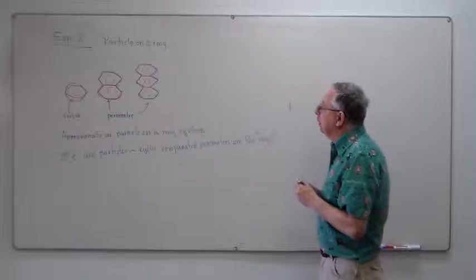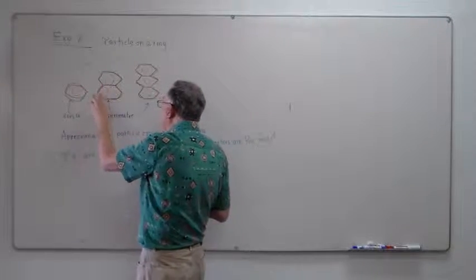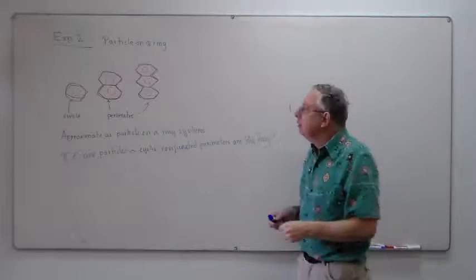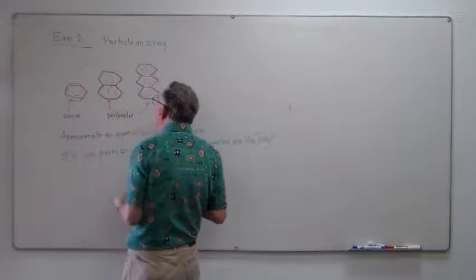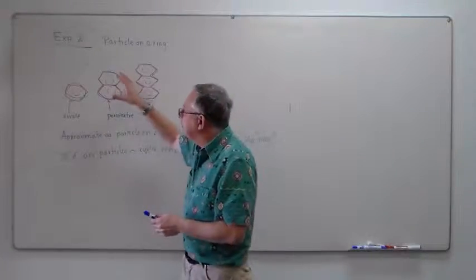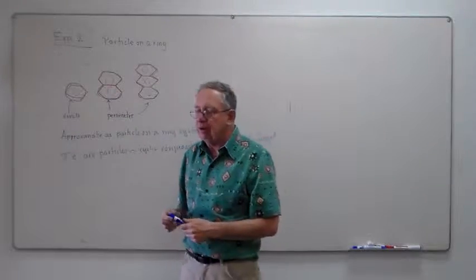And so what we'll be doing is measuring the electronic spectra of progressively larger ring-type systems and seeing if we can develop a correlation between the quantum mechanics of particle on a ring and its energy levels and the size of these rings, something that we can follow experimentally in the laboratory.